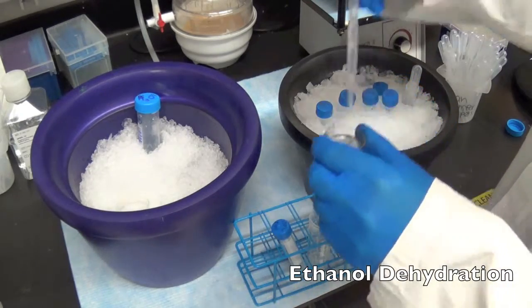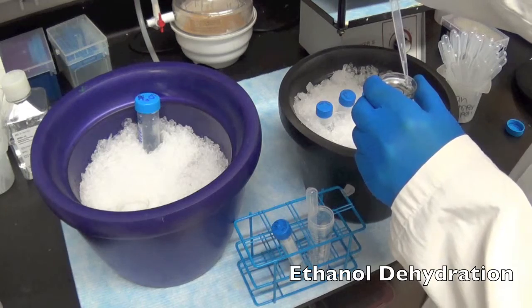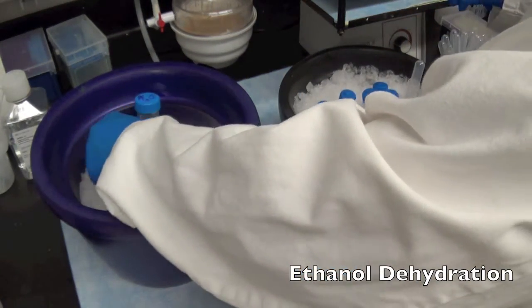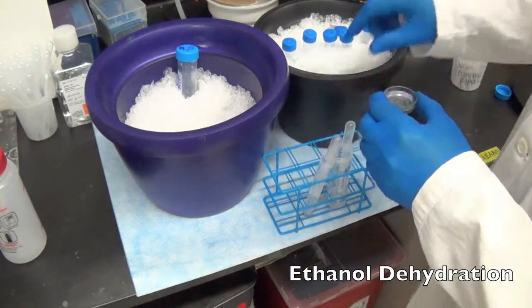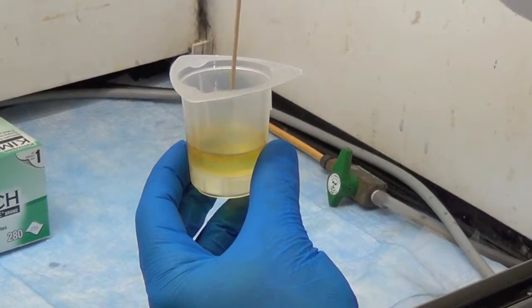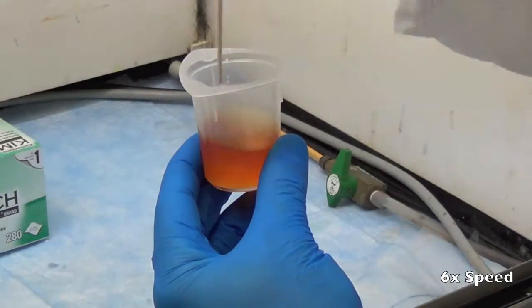We usually use 3-minute washes of 20, 50, 70, 90, 100, and 100% cold ethanol in that order. This process is finished by one final wash with 100% pure ethanol at room temperature. After dehydration, the sample is embedded in resin. Here we use Durcupan epoxy resin.